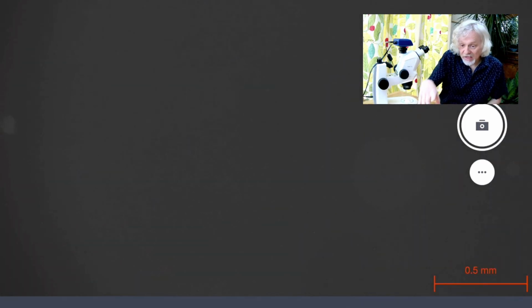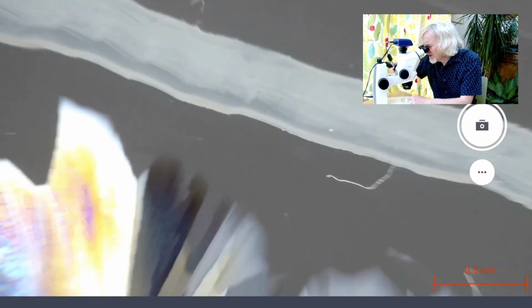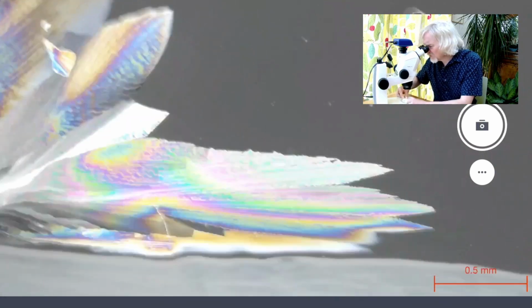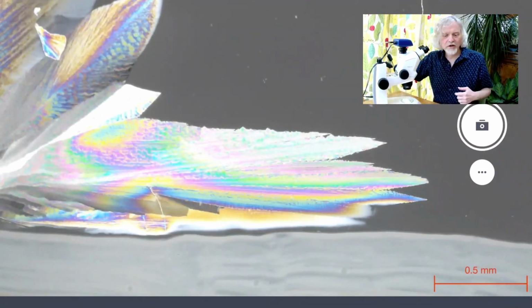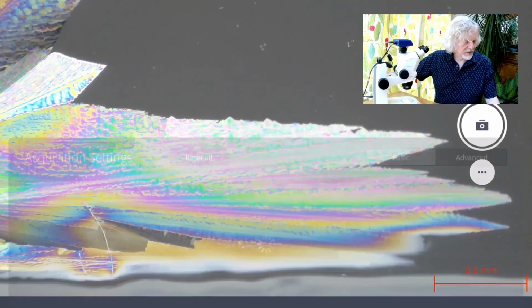Incredibly beautiful. But what I'm going to do is go back to this other citric acid crystal that I was growing. And this one, oh blimey, this one has grown. It's grown massively since I last looked at it. When I looked at it earlier today, it was just a few little bits. And this one has grown these cool sort of needles almost out like that.